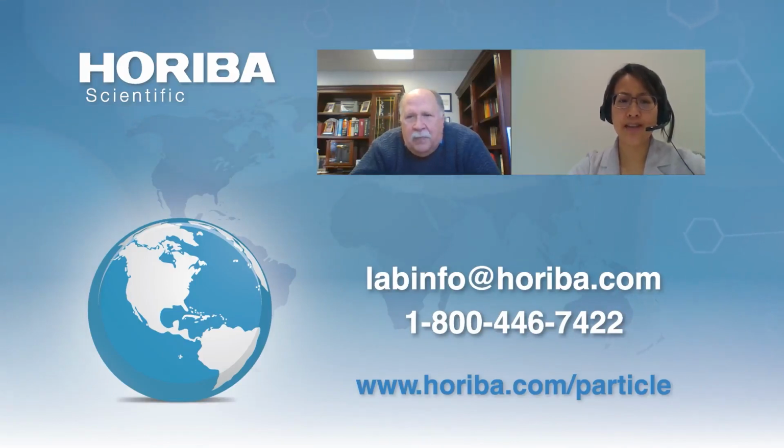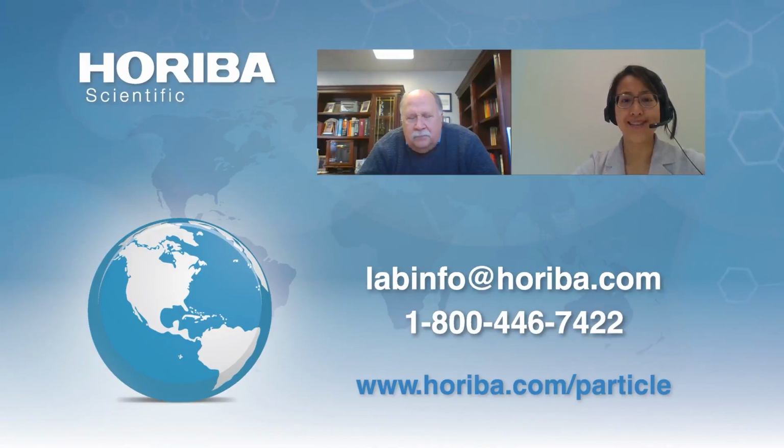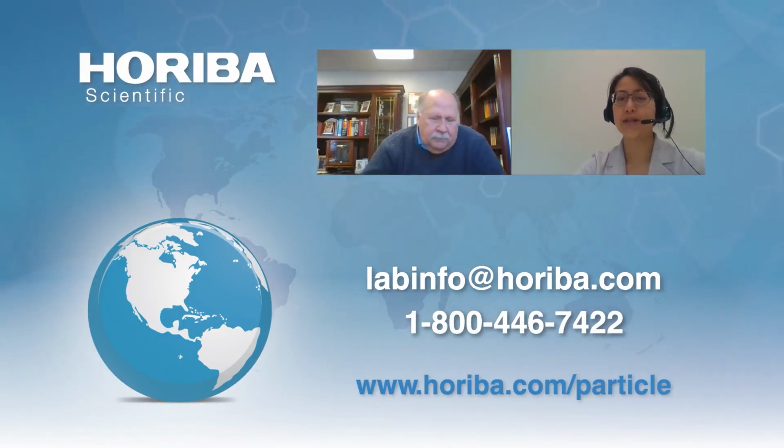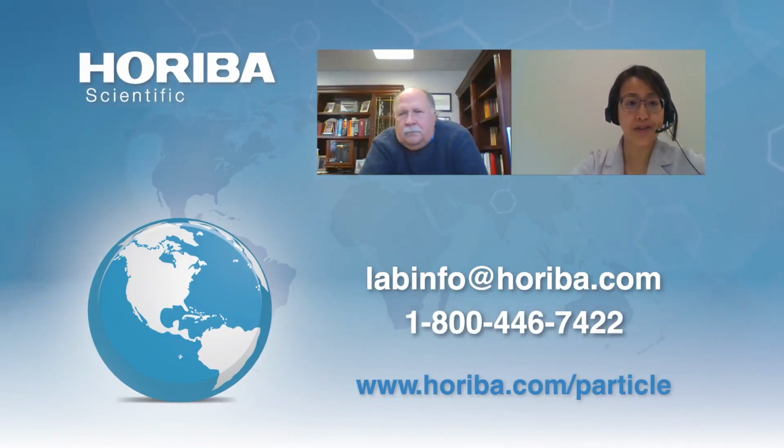I agree. I think typically a 5-to-1 ratio is when you begin to see a bimodal distribution, so that larger peak isn't necessarily agglomeration. We have the PSA 300 automated microscopy that may be more fitting for pharma people looking at smaller particles than the range that the CAMSIZER offers.